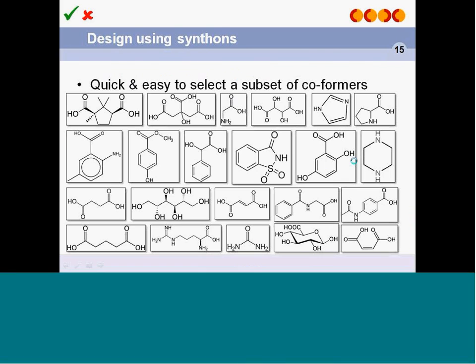So what can we do with these results? Essentially, if we take an overview of all of the coformers that the study used, we can pick out the ones which, using the Solid Form Suite motif analysis, are shown to have competitive interactions with the pure form, and pick out the ones which are indicated not to have any competitive motifs.